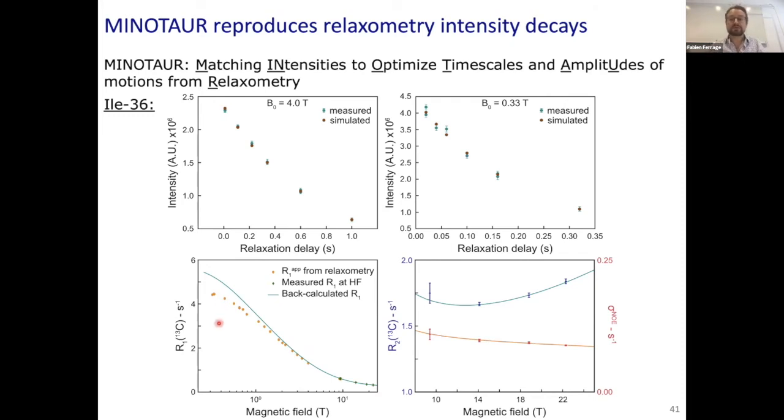The question is just, do we estimate this right? Is this deviation too much or too little? And to validate this, actually, we would need to measure relaxation rates in an accurate manner at fields that are incompatible with a high-resolution, high-field NMR. So how do we do this?